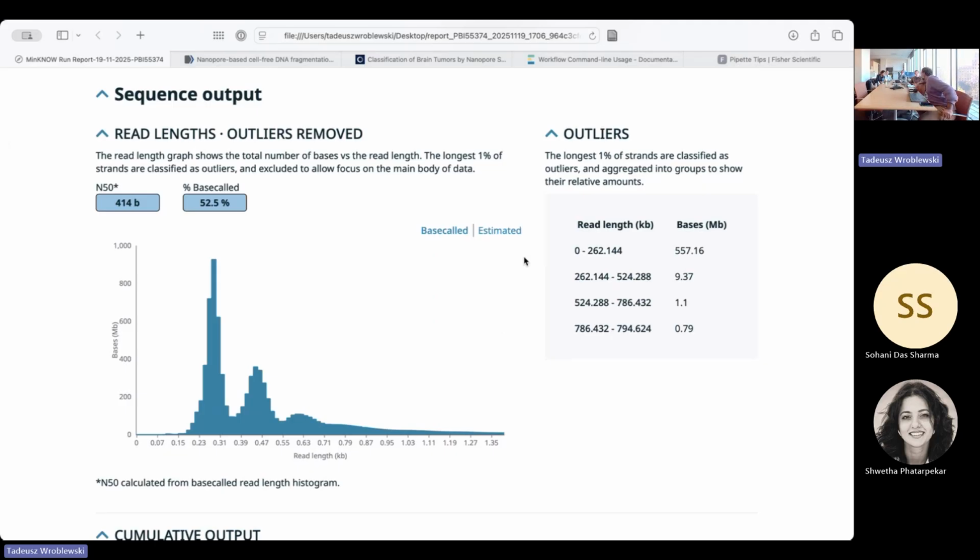I understand the benefit from yesterday was real time, to see how things are going. Could you summarize the benefit of looking at real-time methylation calling, is it an evaluation of how well things are going? Maybe you can see that the sequencing is progressing, and we have confidence that it's going well. For me, the bottom line is, why would I want to see the real-time methylation? No, we want to see it. Yesterday, I just did not do it because this is the first time we are doing the pilot, and we can do it as post-run calling. But I think it is always beneficial to do it in real time.